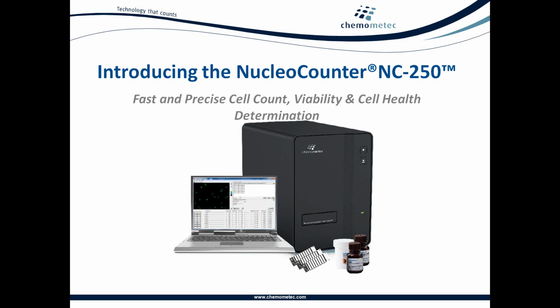I'm going to show you some data in the end and how to export these data into the Novo software. And then I'll hand this presentation back to Sean, and he will show you how to work further on with all the data in the Novo software, the FCS Express.